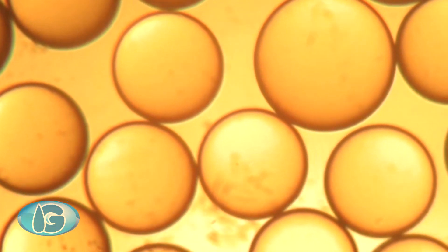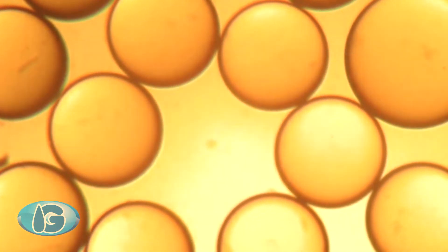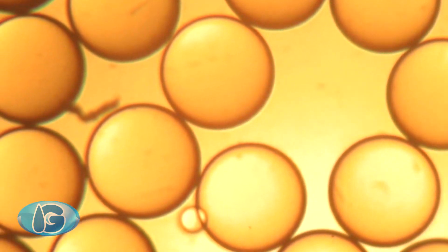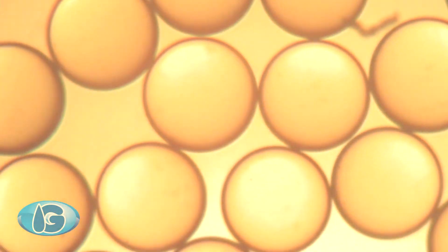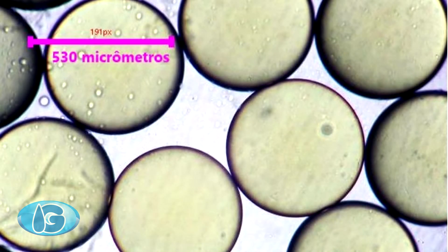Here we have another brand of resin, a kind of uniform resin. We measure and results was 530 micrometers of diameter in the most of measures.